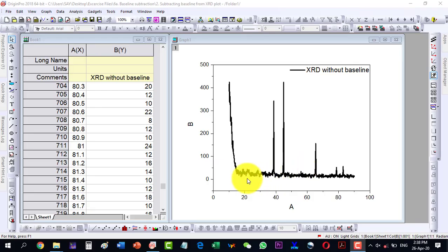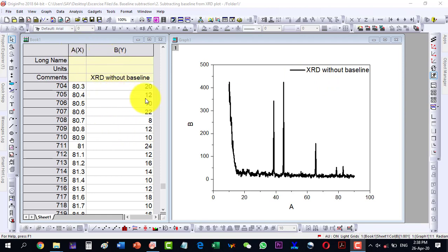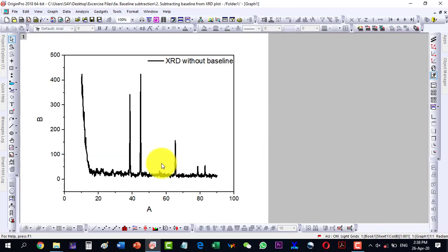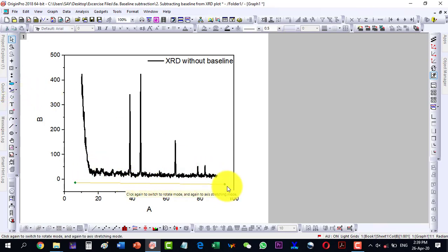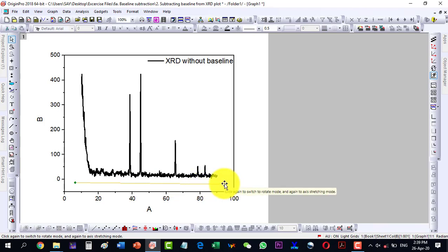In this video we will talk about how to subtract baseline from XRD data. Here we are having the XRD data and here is its plot. Although it seems that no baseline correction is required here because it is almost smooth data, it requires a little bit of correction, and we can see this by drawing a line.